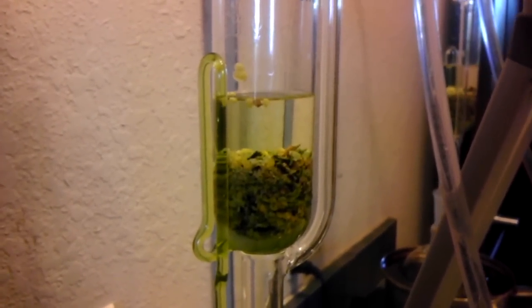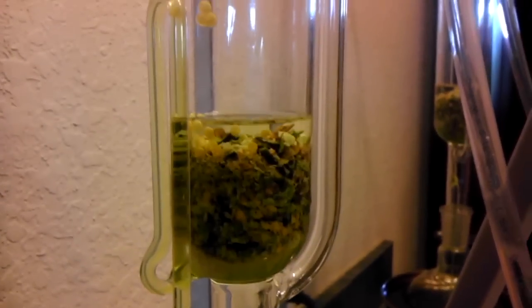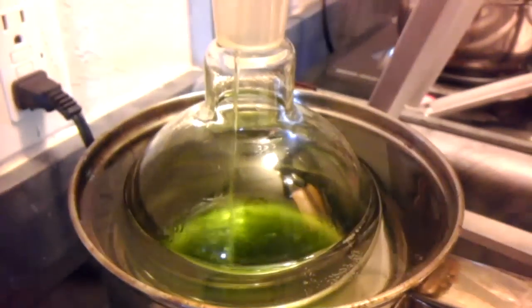It's really fun to watch. It took about 15 minutes per cycle, and I let it run for — I don't know — maybe ten times.